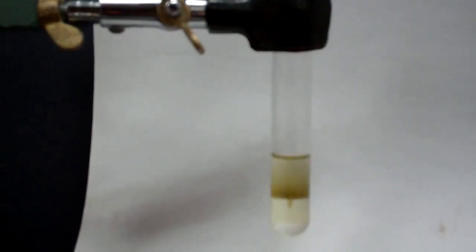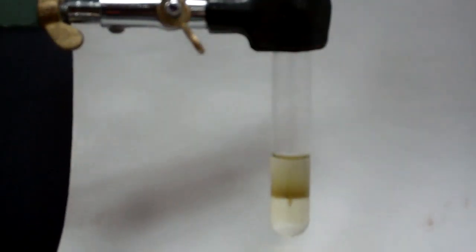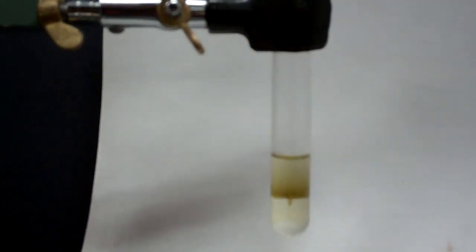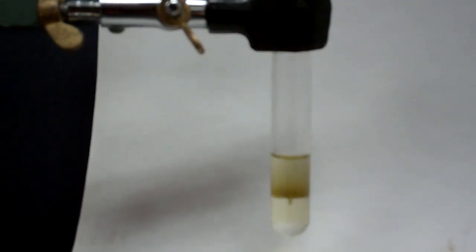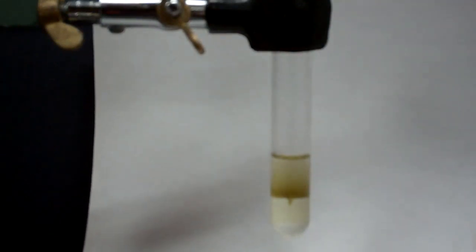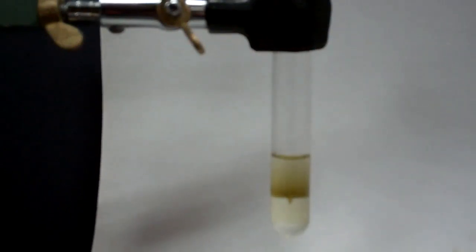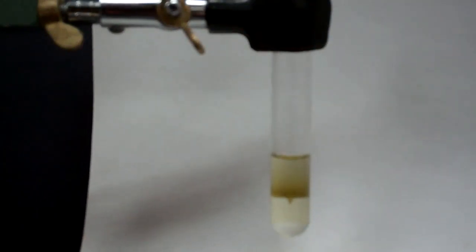If you do not form this boundary, this dark brown ring, then that means you do not have nitrate in your sample. The key to this is just being very steady and allowing that acid to trickle down the side to make sure that you do not disturb that boundary so that the ring has a chance to form.